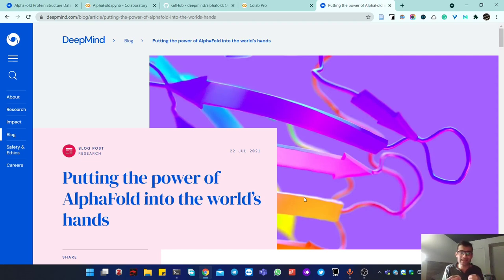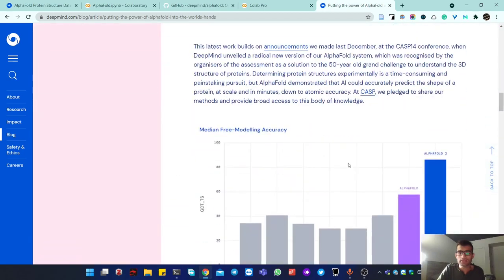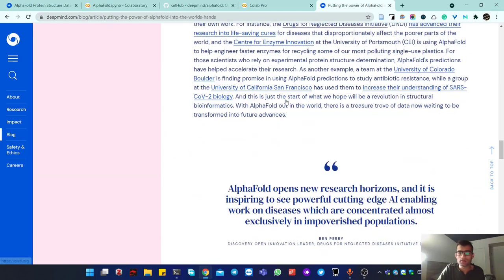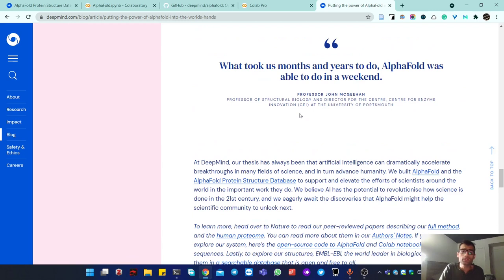This is still not that accessible to everybody. I searched Google and YouTube to find a video that explains in simple words how AlphaFold works and how to start using it, and I couldn't find anything. So I decided to make a video. First, I want to show you this blog post from the DeepMind website — they made AlphaFold — where you can read the basics of how it was made, how it's used, and how they won CASP14.